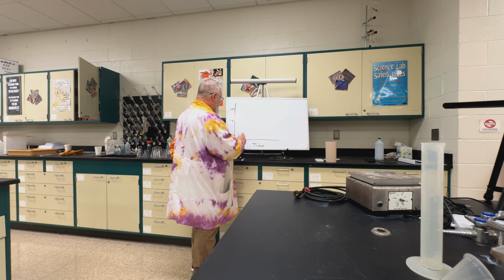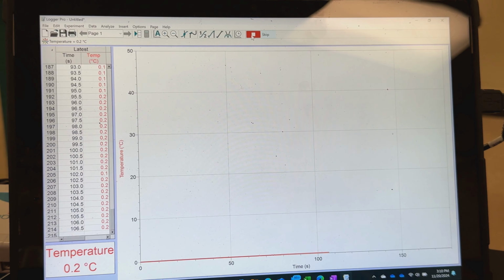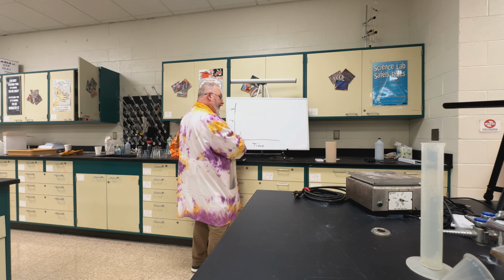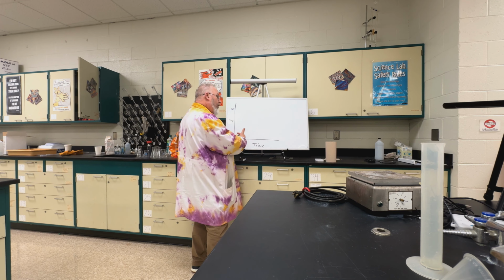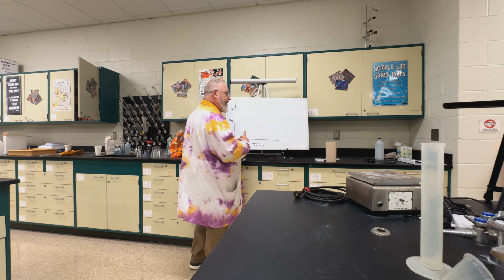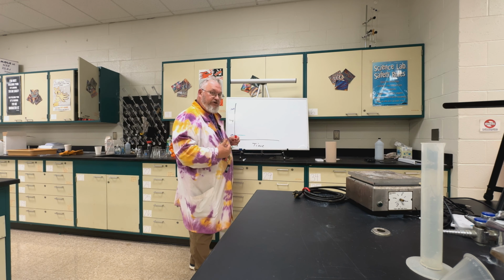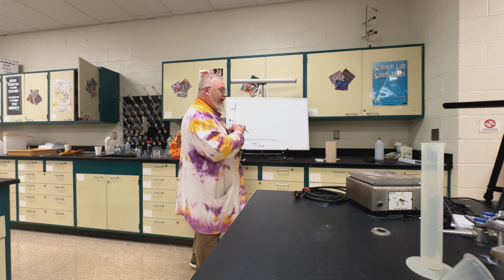What we're going to see in our lab is a plateau, where we're adding energy from the heater, but it's going to be pretty flat until all the ice is melted. Now we'll have water in there and ice, but the energy that we're adding is not thermal energy, it's phase energy. We're adding that energy to break the attractions that are holding those molecules together.